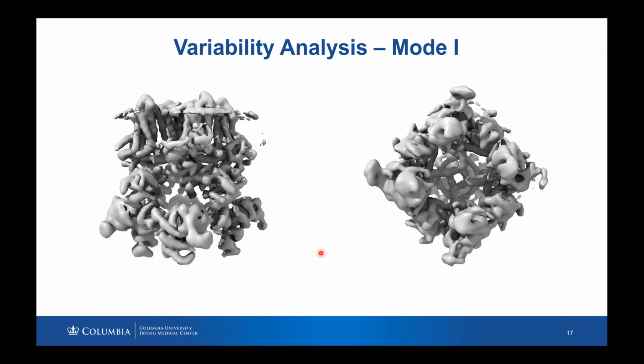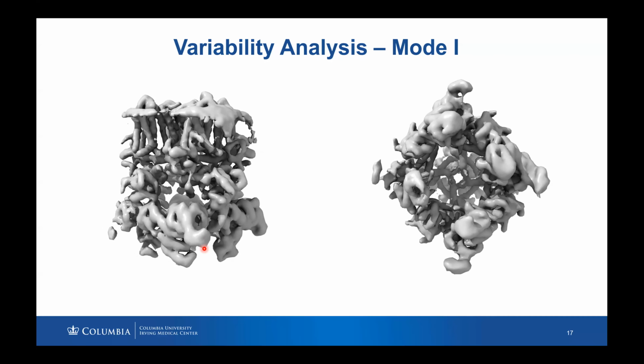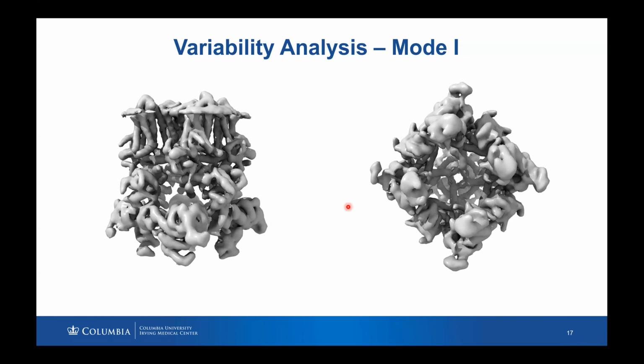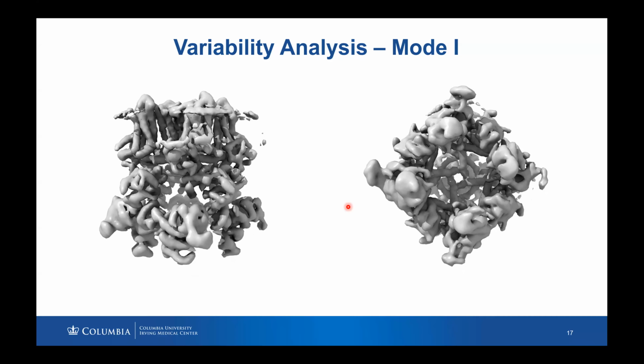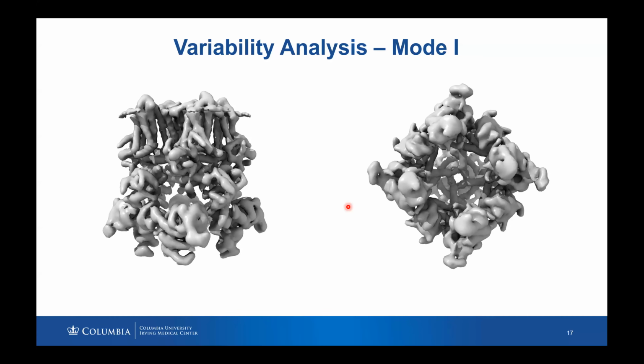Oh yeah, I absolutely agree. At least what we observed for these lower parts, these MHR regions, is that those are only rigid body movements. There is no flexibility in those regions. It's just that the whole region of each subunit moves and rotates. So we did this analysis, at least part of it.